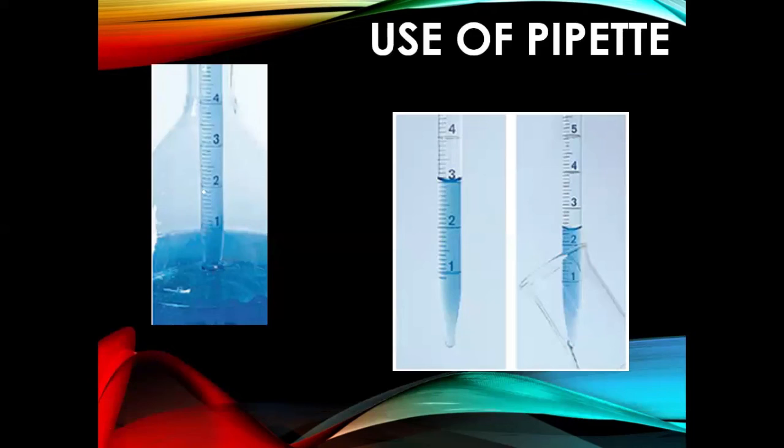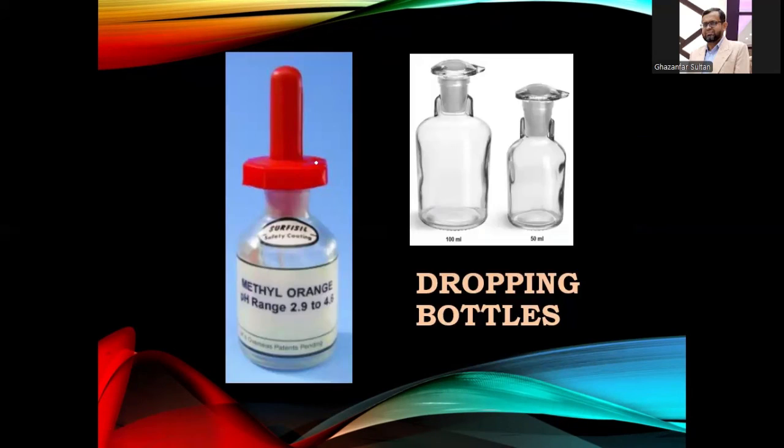Again, when we use any glassware, we should observe the lower meniscus. Now see, these are the dropping bottles. There are different types of dropping bottles. Some are these. Just by tilting, you can transfer some drops of the indicator. And some are with this dropper. You can suck this liquid in this dropper and add it dropwise into the conical flask.